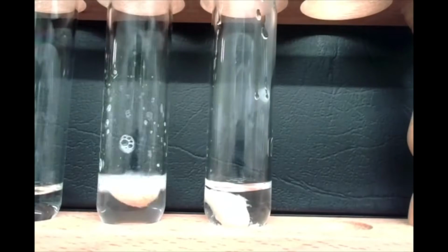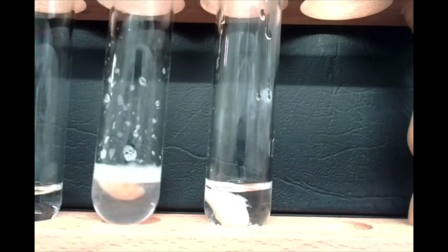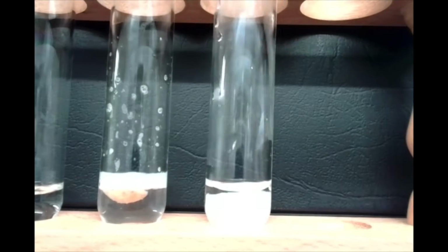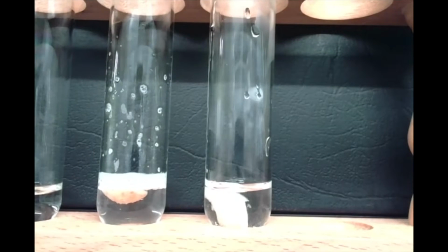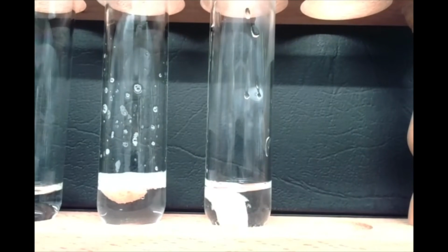I just wanted to point out this little difference between this fresh potato over here and a boiled potato over here on the right. If you notice that difference in catalytic activity between them, catalase, which is a protein found in potatoes, is an enzyme, which is a protein catalyst, right? It acts as a catalyst, and I'll let you interpret the evidence you see in this lab.